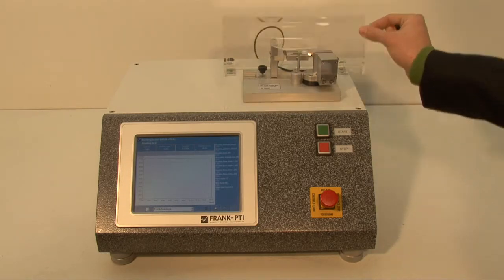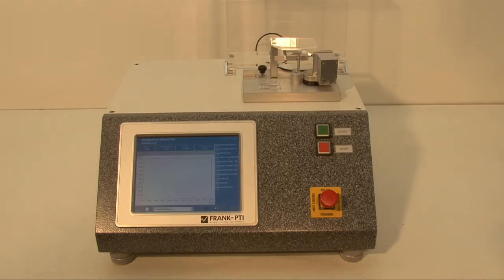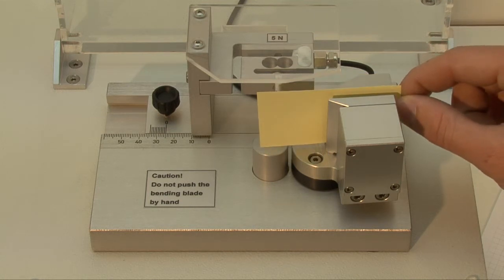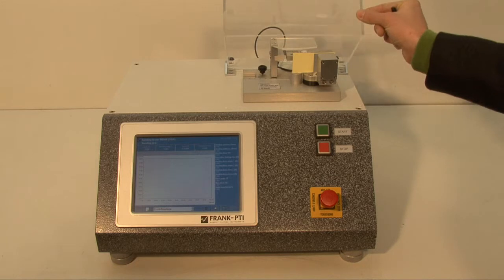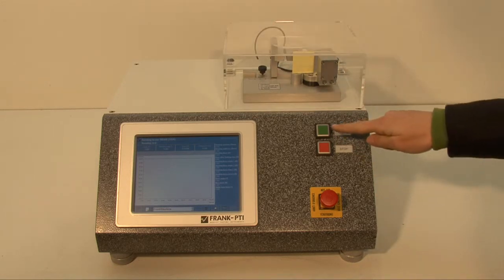Open the cover. Put your sample between the clamps. Close back the cover. And push the green start button.